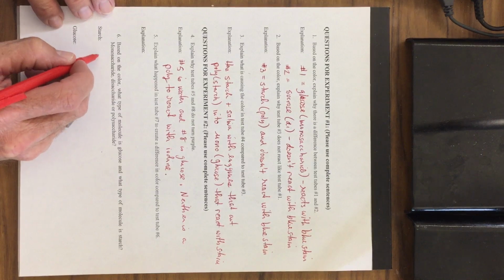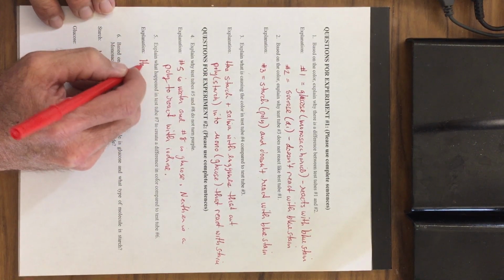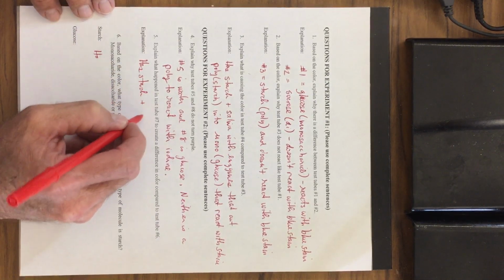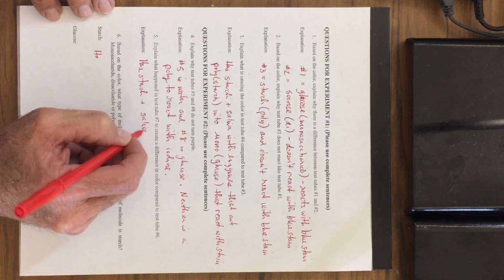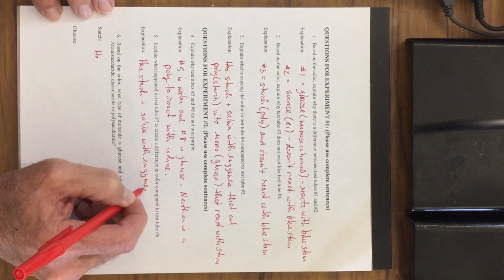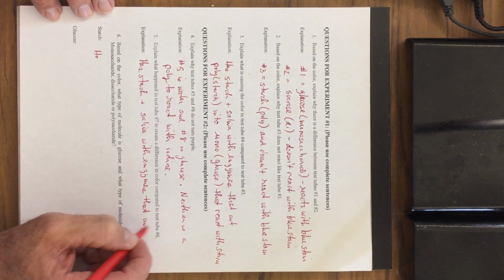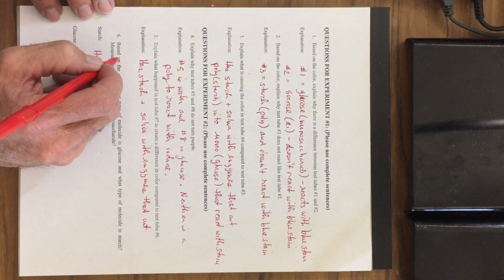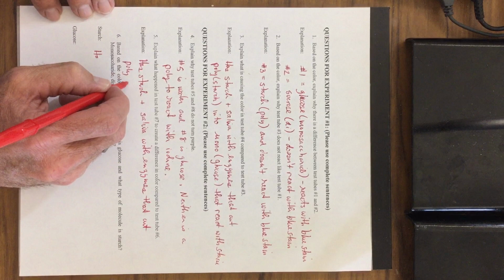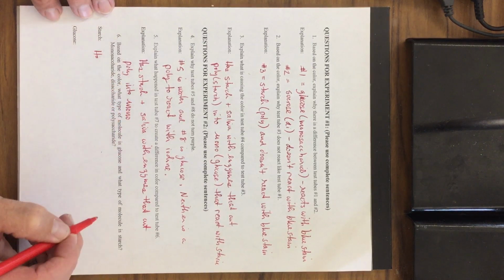So this is a very similar answer to the previous one. It has starch plus saliva with enzymes that cut the polysaccharides into the monosaccharides.